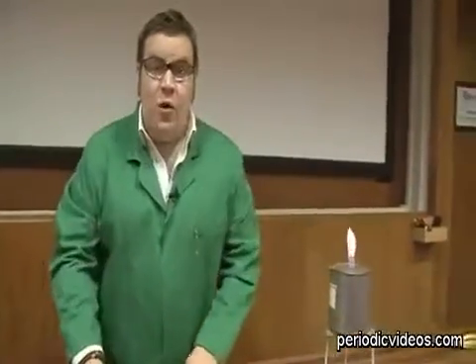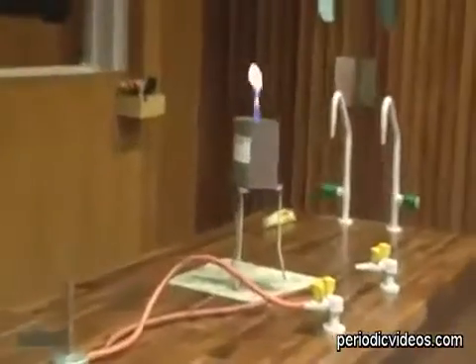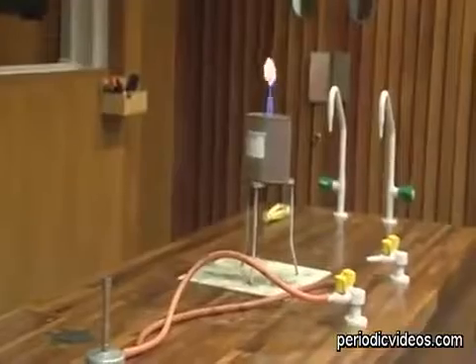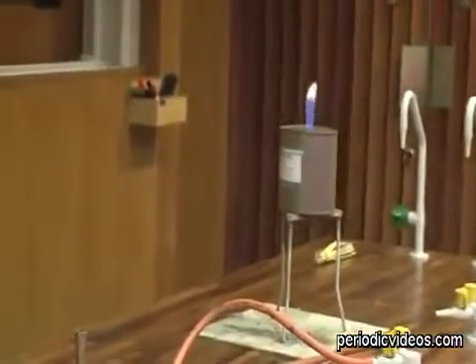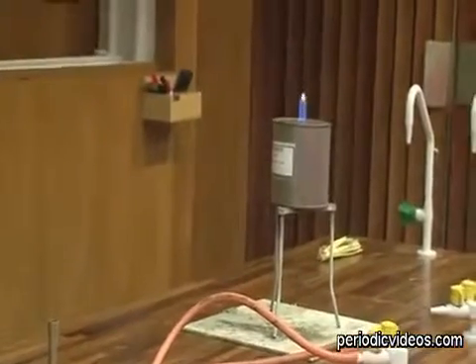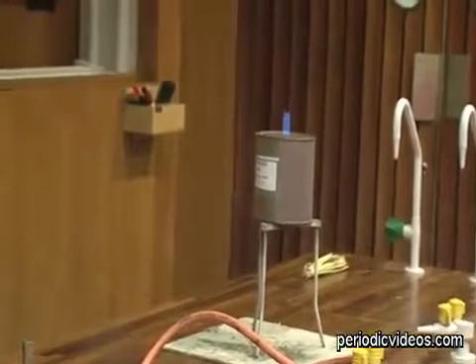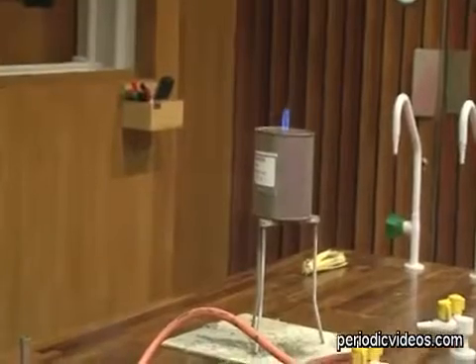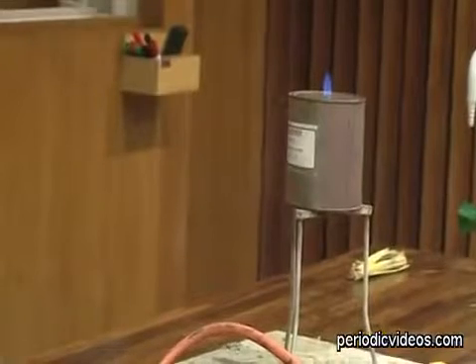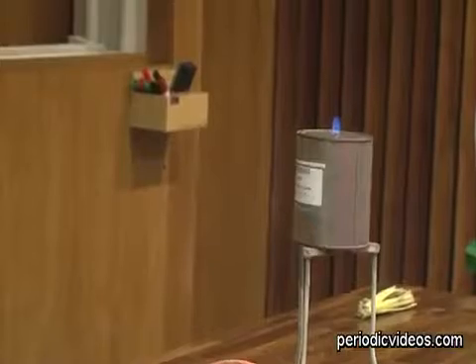So we're going to walk away from it a little bit and wait. So what we're looking for now is the flame on the top. It's getting smaller and smaller and smaller as the burning methane gets less and less and less. And then hopefully that flame will pop back inside the vessel and pop! Let's see. It could take a while because these cans, they do take a while to burn out. So when the flame disappears, cover your ears. It's not going to be that bad.